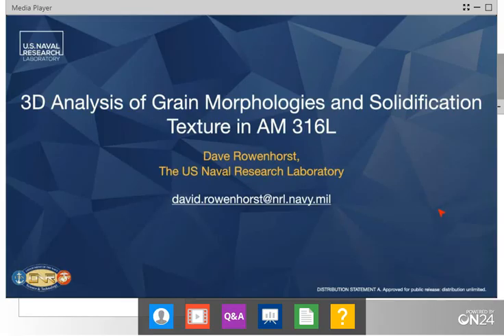I really appreciate the chance to present at the seminar today and talk about this 3D analysis. We're going to be talking about how we look at materials in 3D, why we use EBSD, and why that is so important for looking at these additive microstructures that we're seeing. We'll pretty much concentrate on one data set today. It's additively manufactured 316L, but it's quite a dense data set, so there's actually quite a bit of information.